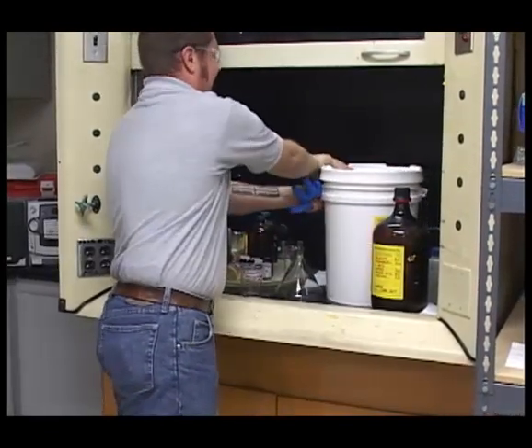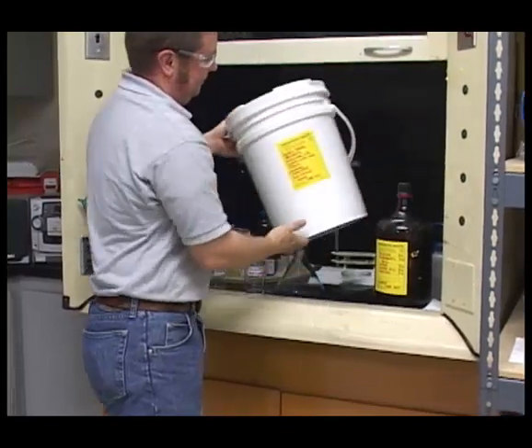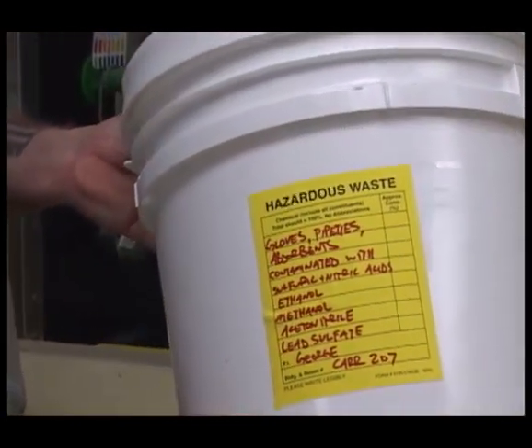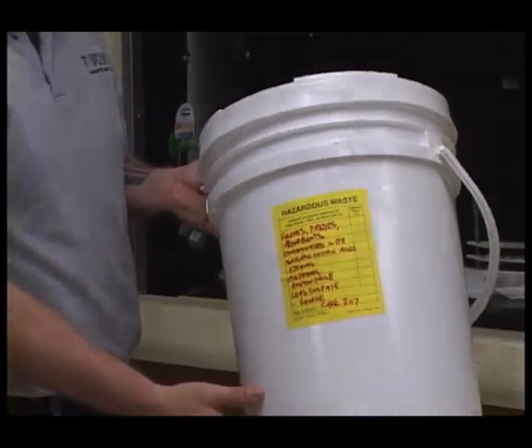When adding the first pair of waste gloves into the container, you may simply label your container with "solid waste contaminated with," and just give us a short list of the chemicals you most frequently are utilizing in your laboratory.